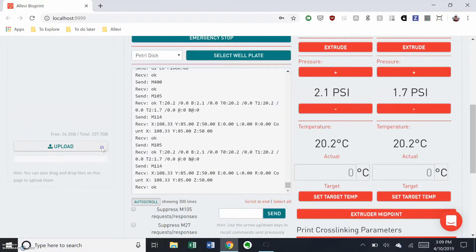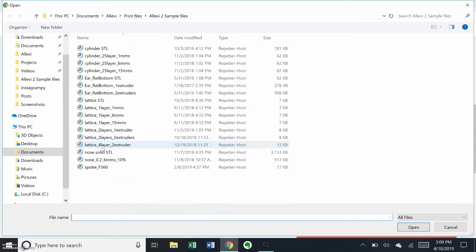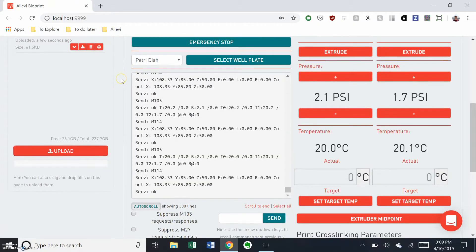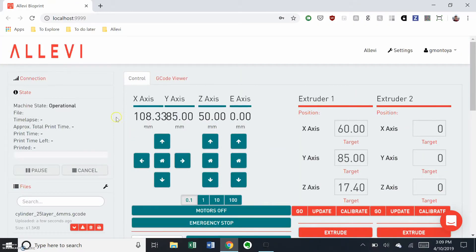In the software, upload your desired g-code file. Today we'll be using a 25 layer cylinder. Click load and print and watch your printer go.